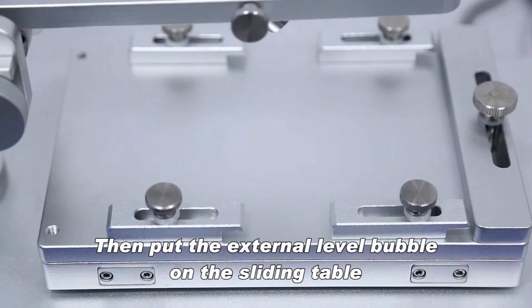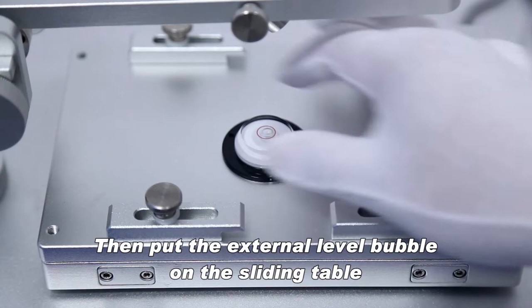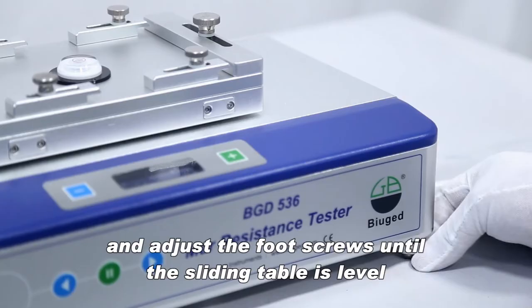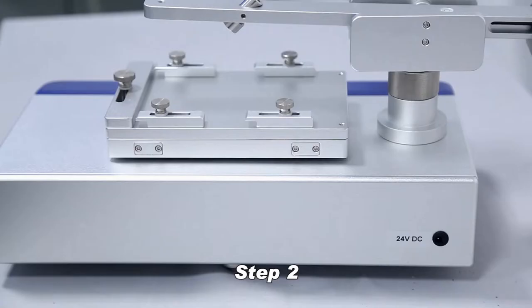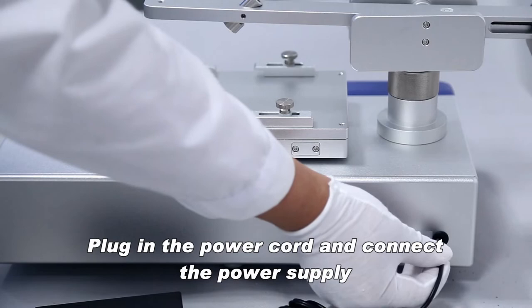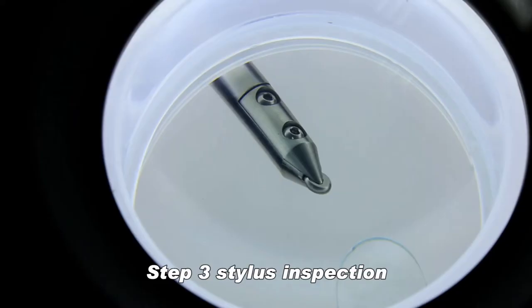Place the instrument on a stable and level bench, then put the external level bubble on the sliding table and adjust the foot screws until the sliding table is level. Plug in the power cord and connect the power supply.